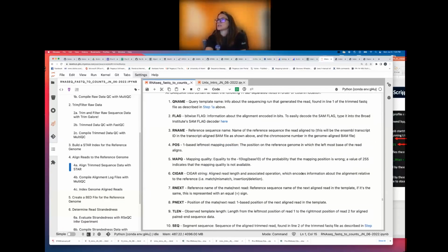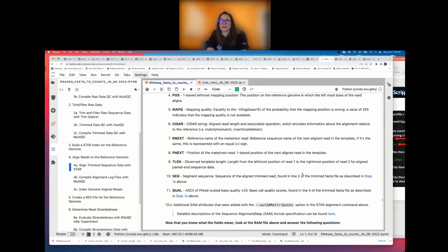Any other questions about any of the columns or how to interpret these BAM files?